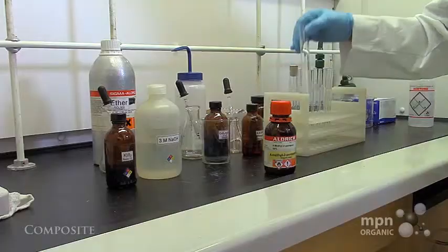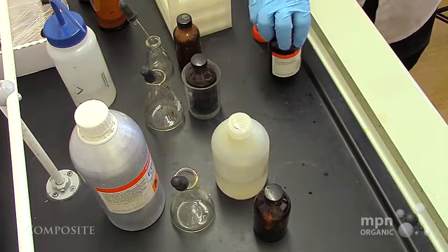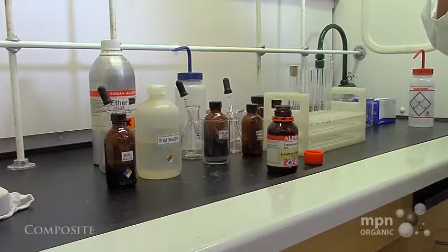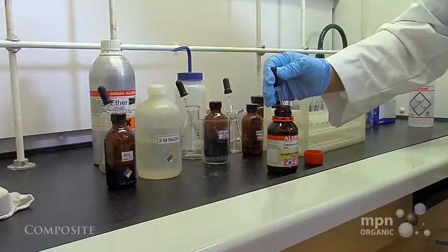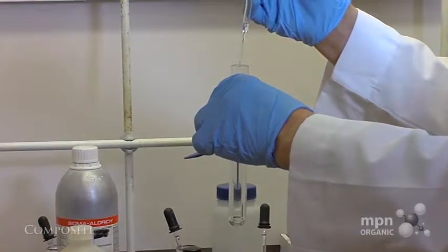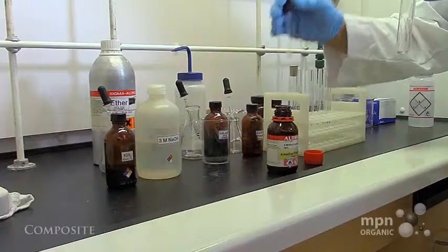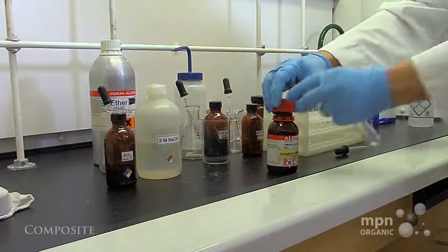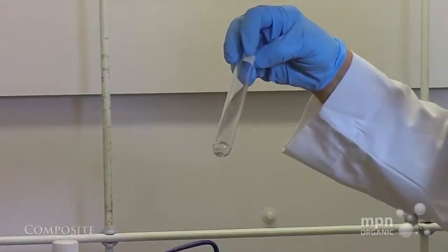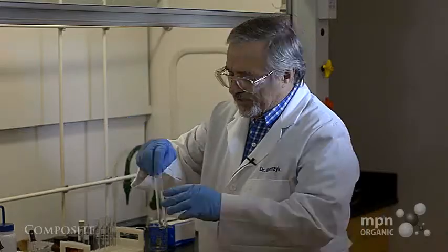So let's just take some of the 4-methyl-2-pentanol and put about 10 drops in a test tube. We don't need very much for this because we've seen that these tests are rather sensitive. But let's count: 7, 8, 9, 10, 11, 12. I'm going to put about 12 drops in this test tube. This then should be enough to be able to conduct both the tests that I want to do.